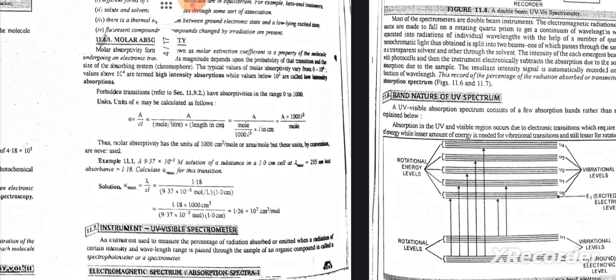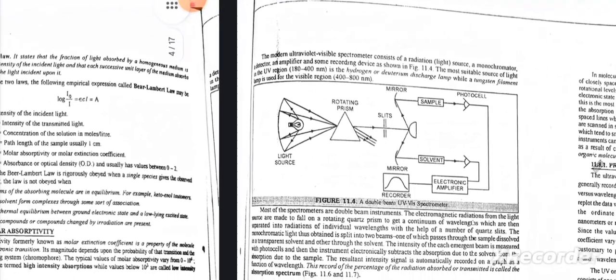Instrument: UV visible spectrometer. An instrument used to measure the percentage of radiation absorbed or emitted when a radiation of certain intensity and wavelength range is passed through the sample of an organic compound is called a spectrometer or a spectrophotometer. The modern ultraviolet visible spectrometer consists of a radiation source, a monochromator, a detector and amplifier, and some recording devices. The most suitable source of light in the UV region is the hydrogen or deuterium discharge lamp, while a tungsten filament lamp is used for the visible region.